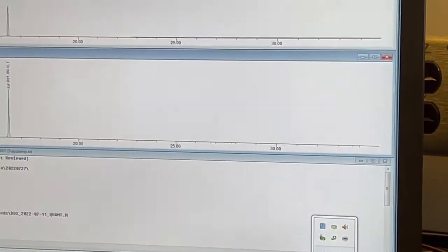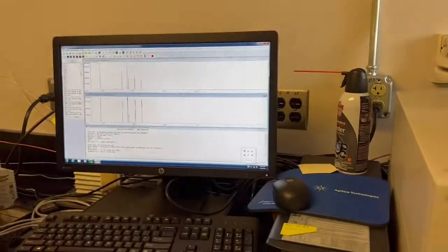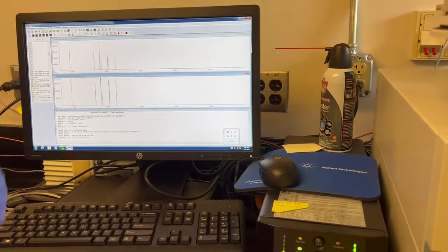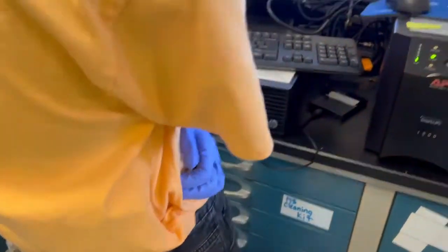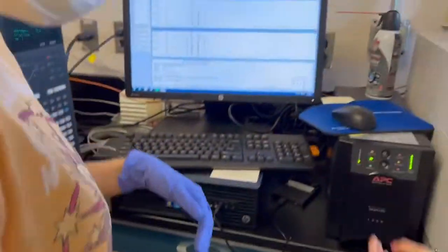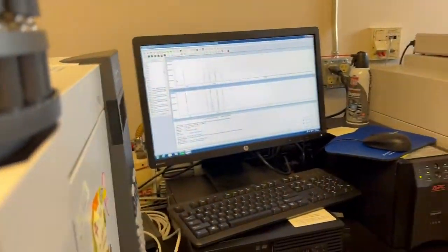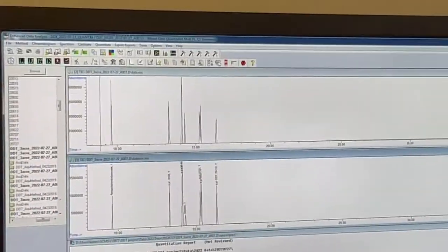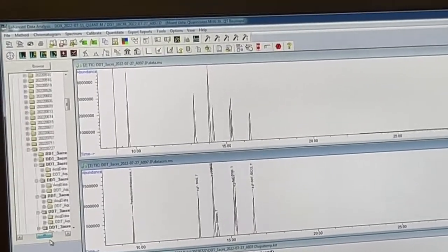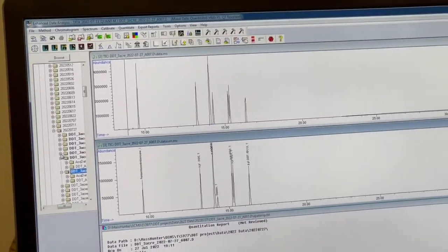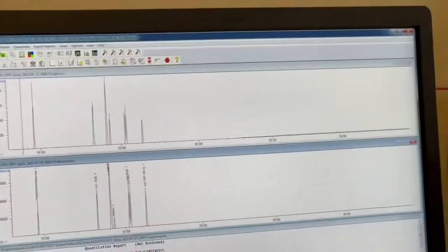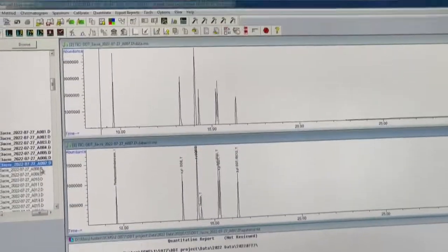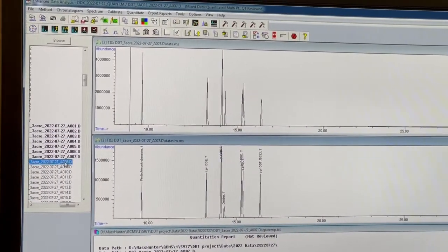So now we're done our calibration. Now I'm going to go to the samples. I can't on this side. Okay, so I'm going to close this. So this is sample 8.